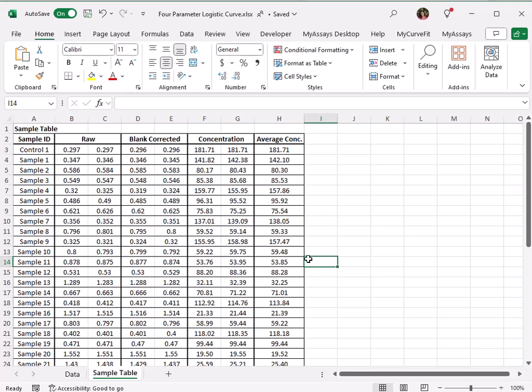Some of the benefits to using myassays.com over analysis in Excel include pre-configured protocols for typical analyses and commercially available kits, support for multiplex analyses, including the best fit feature, which can apply a different fit to each analyte based on the specified goodness measure, support for interassay analyses, the ability to quickly and easily change the layout without the need to update cell references. You can easily visualize and interact with your curve, including quickly and easily flagging and removing outliers, and easily share your results with colleagues, and there's no specialist software to install.